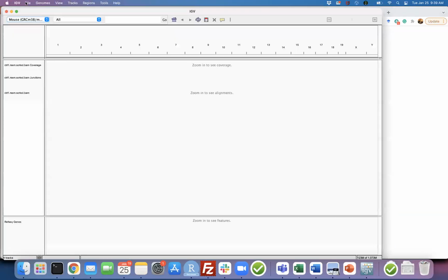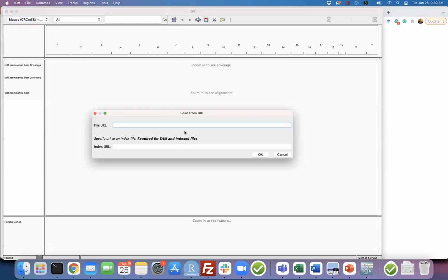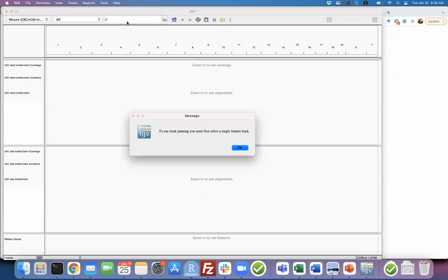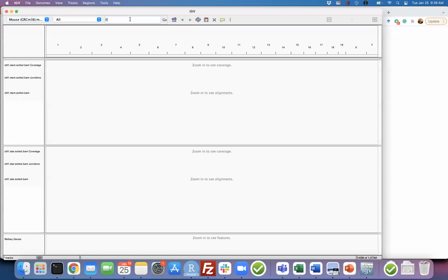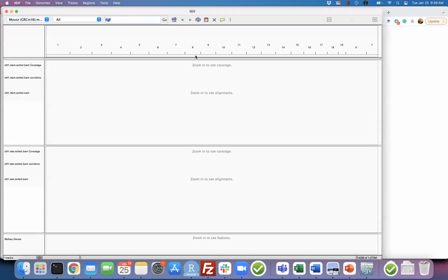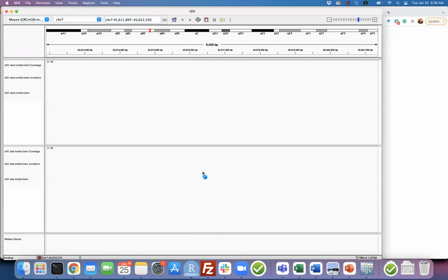And one of them was transcriptomic alignment. The other one was genomic plus transcriptomic alignment. So in the second one, we're going to see some reads. I don't know why this is doing that, but it doesn't allow me to write 21. I guess there's a bug.